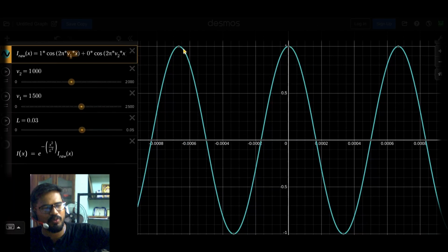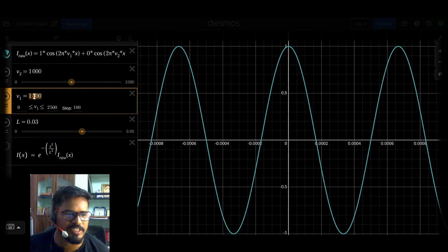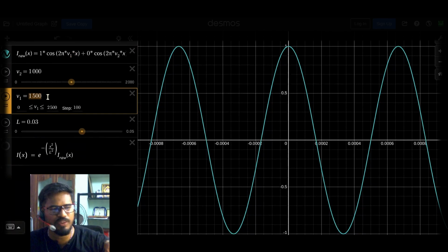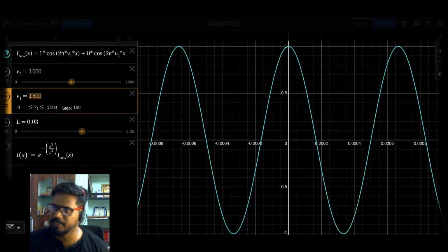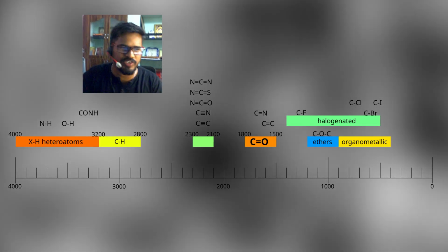If I were to do the spectrum of this, how will this look? So this is to make it reasonably realistic. This is in, say, 1500 centimeter inverse. Wave number, 1 by lambda, is in 1500 centimeter inverse. So roughly around 3500, you get the broad OH oscillation, right?